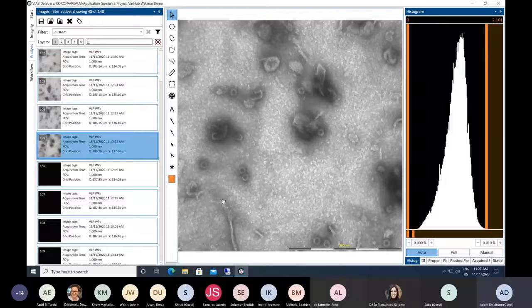The next challenge is actually going to be to manually identify these particles, then hope to perform some particle counts on these, maybe measure their average area. We're actually expecting them to be around 40 nanometers, so hopefully we'll be somewhere around that ballpark. And we do have some tiny little particles like this that I've occasionally seen dotted around, and I will also try and see if I can identify these as well.